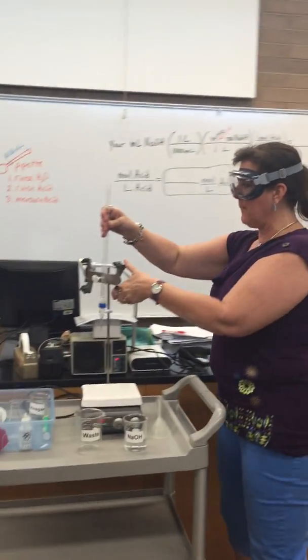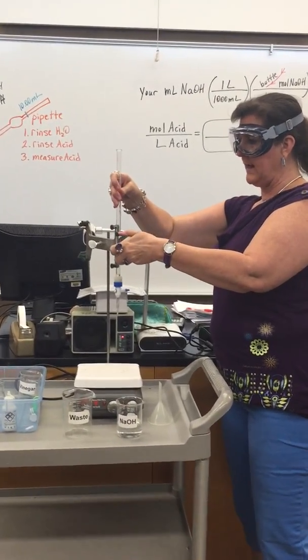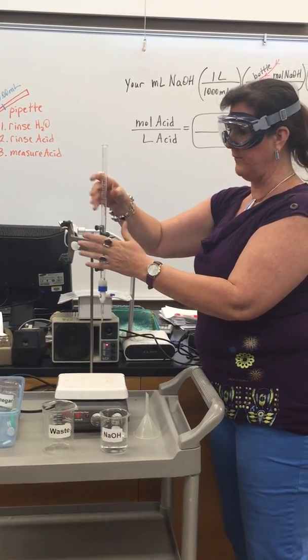I'm going to bring it back and clamp it in the burette clamp. Be careful — if you break this, you bought it. So be very careful.